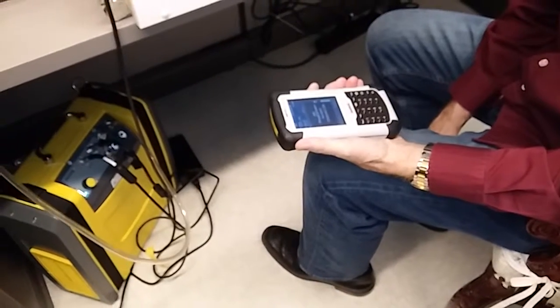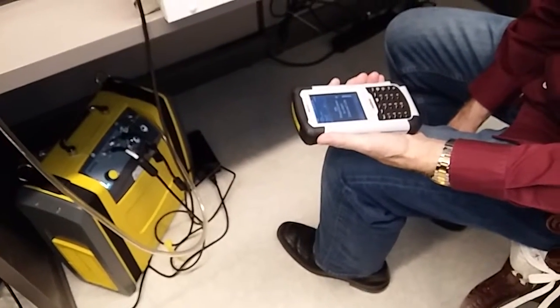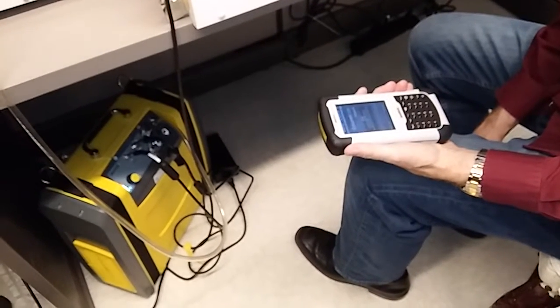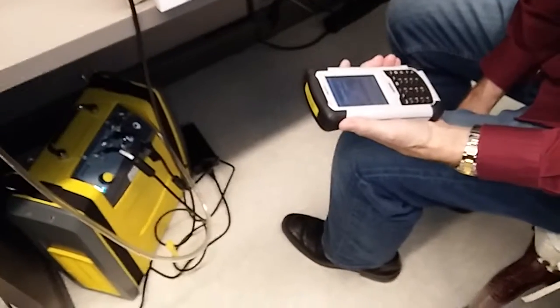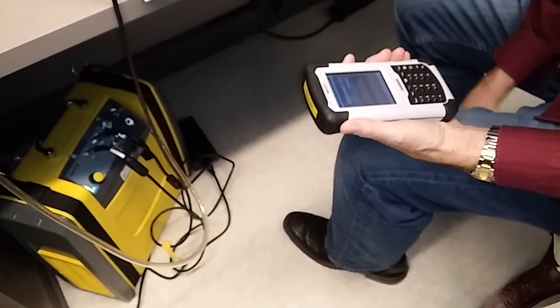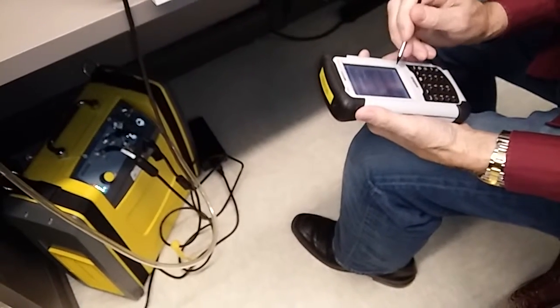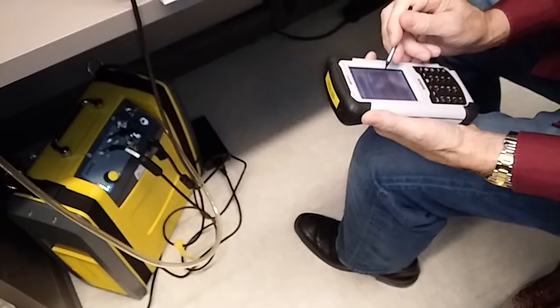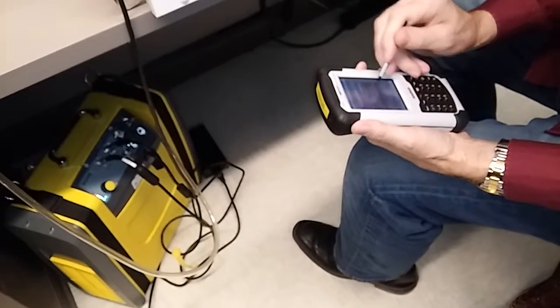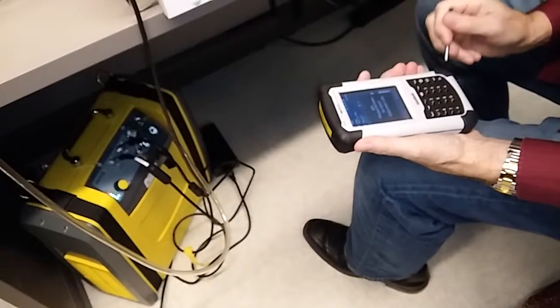It's a nice toy. Enabled. You can try to reconnect. Really? Now it doesn't even read it anymore. Okay. Unable to connect to analyzer. Work offline. You can try reconnecting by restarting. Okay. When you try and restart.